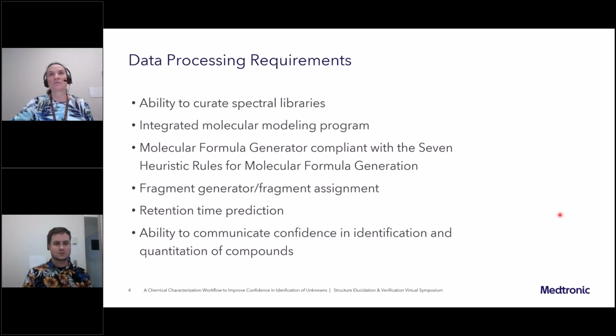So just again, to give background, extractable and leachable work requires that a medical device, or it could be a container or an enclosure for drug products, this also the requirements expand to food containers, where a profile, and also cosmetics, where a profile has to be generated for each of those different containers or the medical device that a toxicologist can take a look at those extraction profiles and predict whether or not, do the safety risk assessment to predict whether or not that container, that medical device, is going to cause a risk to the health of the actual individual, the end user.